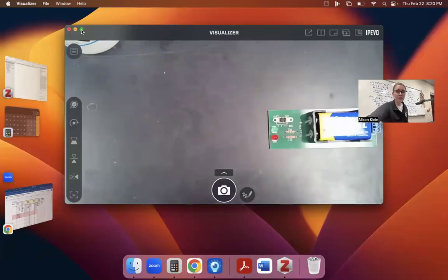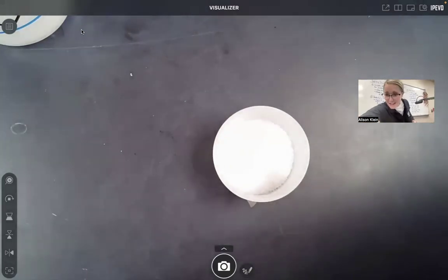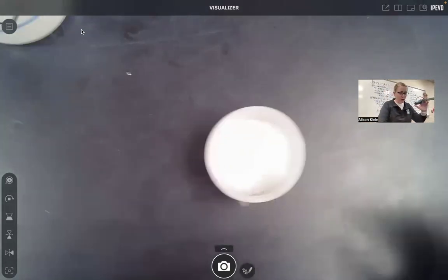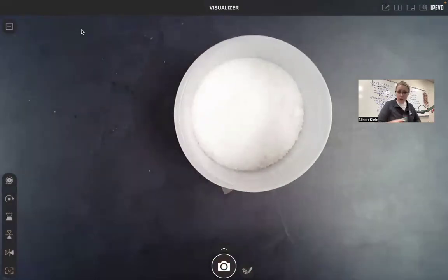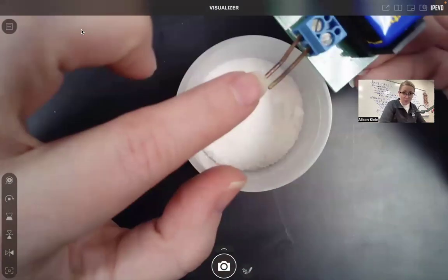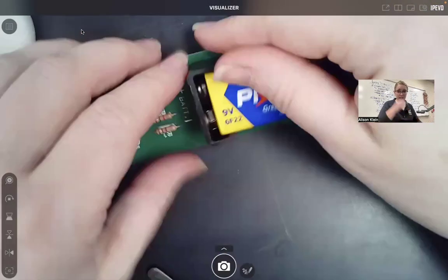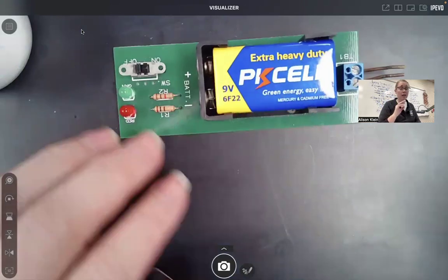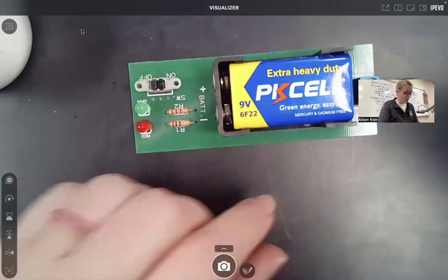So I'm going to first get my sample. Here is sample number 1, and I'm going to ask the question, can I test the solid? In order to be able to test the solid, I must have a crystal that is large enough to fit in between the electrodes of my conductivity tester. So this is my conductivity tester. There are several of them. They're located on the rolling cart that's at the end of the lab stations.